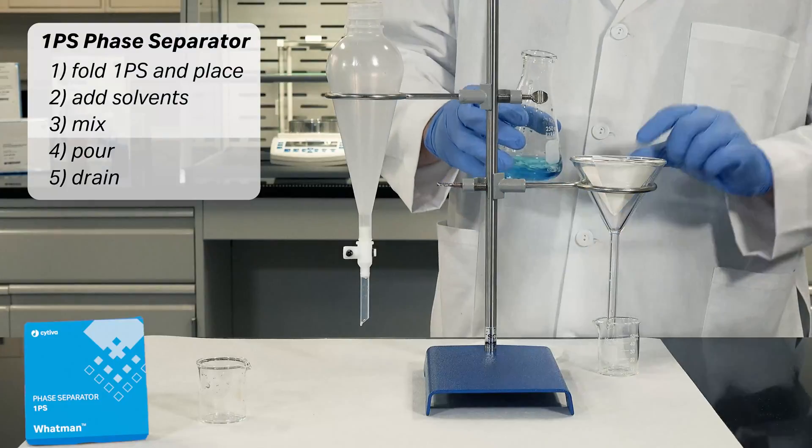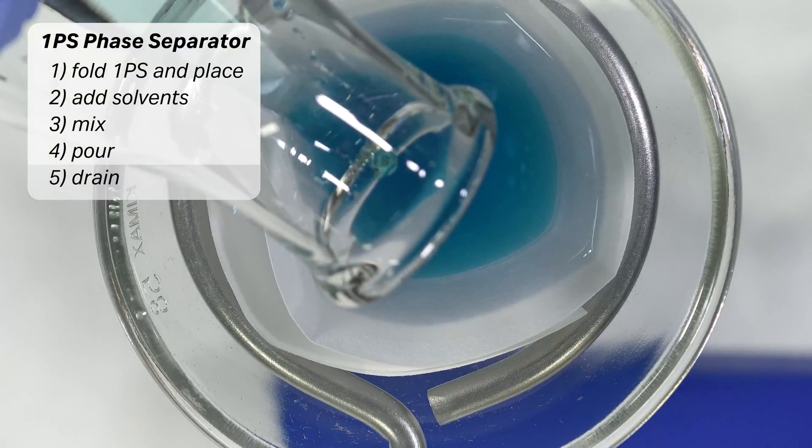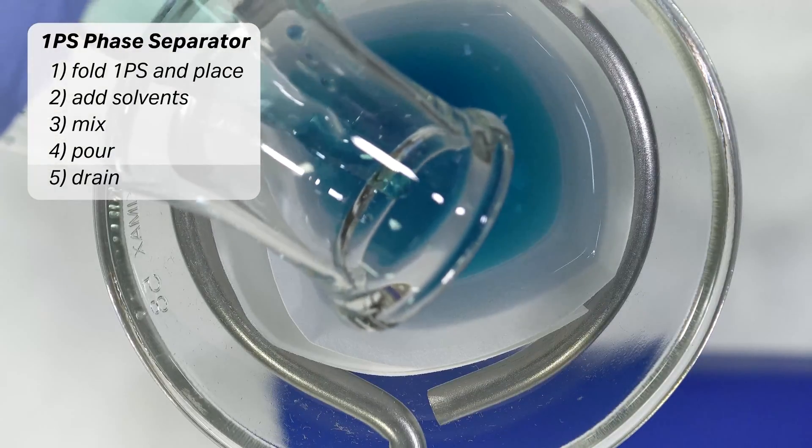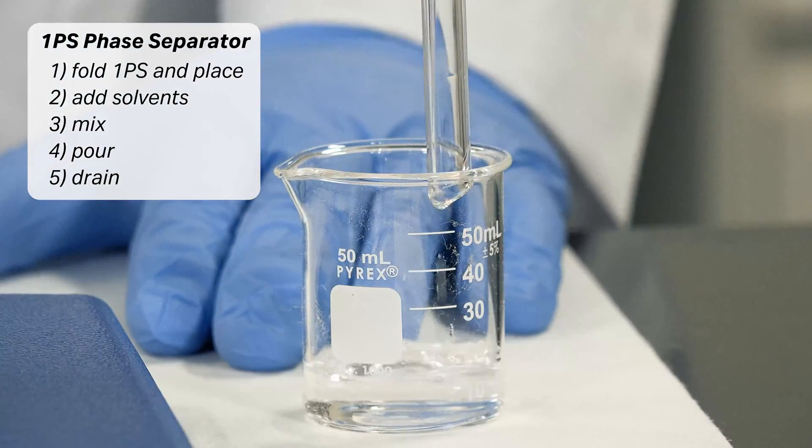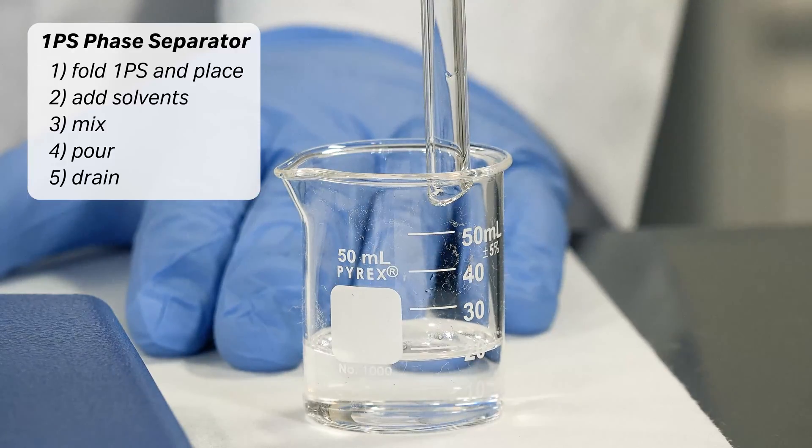Carefully pour the mixture into the glass funnel or filter, ensuring not to overfill. Allow the organic phase to drain from the collection flask. Draining will stop automatically.